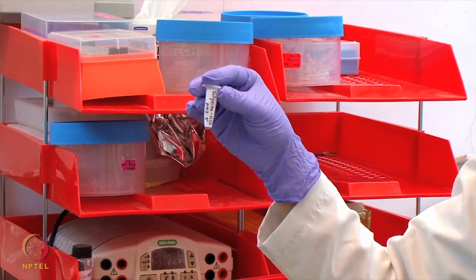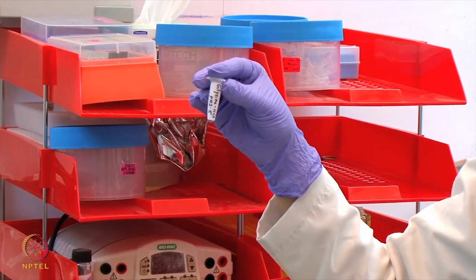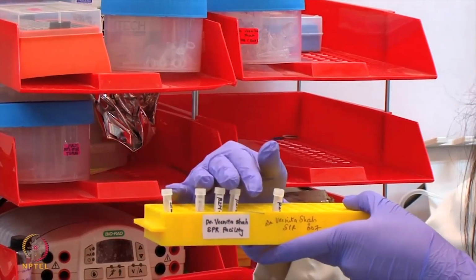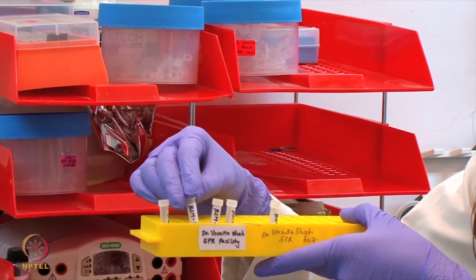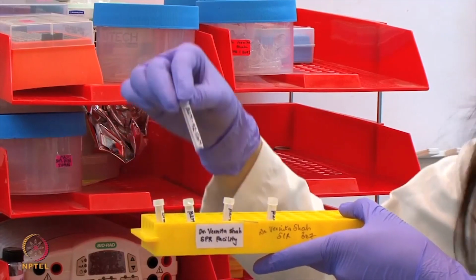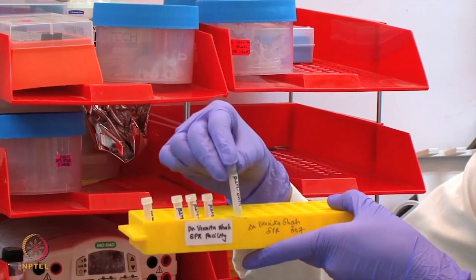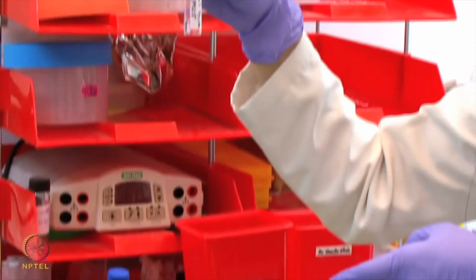For the regeneration of the surface, we have prepared glycine HCl pH 2.5 as the regeneration solution. We have transferred all the solutions in the specialized tube, starting from the startup, beta-2M concentrations starting from 85 nanomolar, 42.5 nanomolar, 8.5 nanomolar and 0 nanomolar. The regeneration solution is placed in this glass vial.